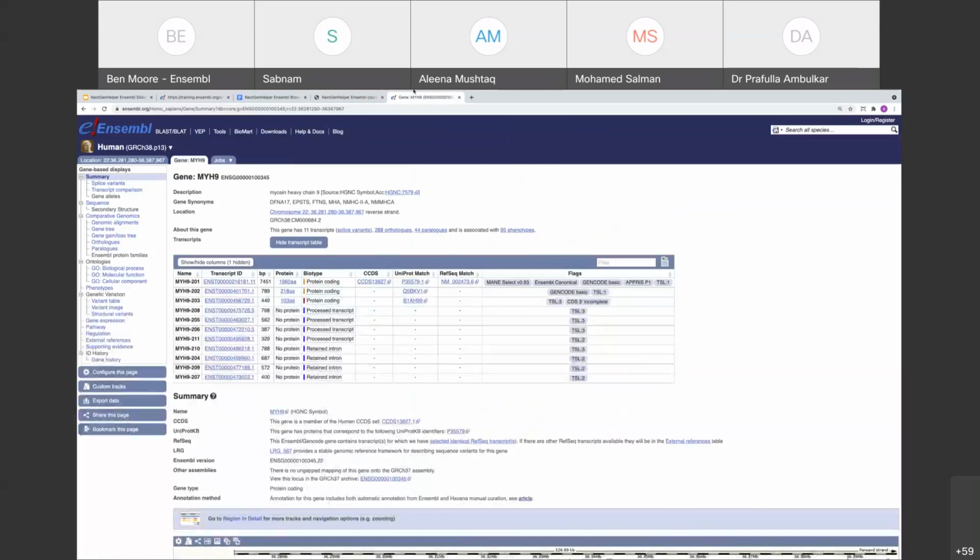So we can find information about the transcripts by showing the transcript table. So we can count all of these transcripts. And we also have this information about this gene line, and this gene has 11 transcripts. And the protein coding information is given in the biotype column. So we have 3 protein coding transcripts.